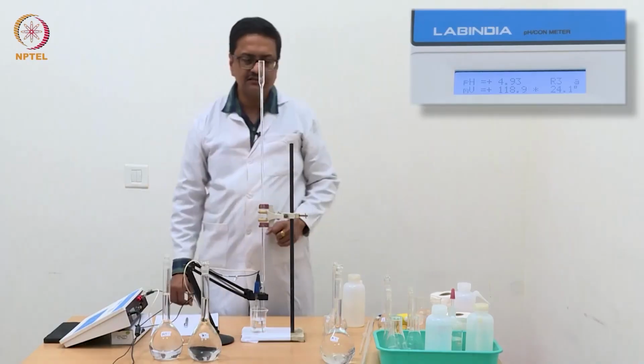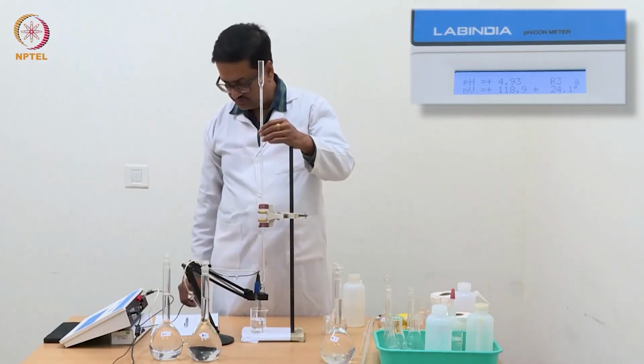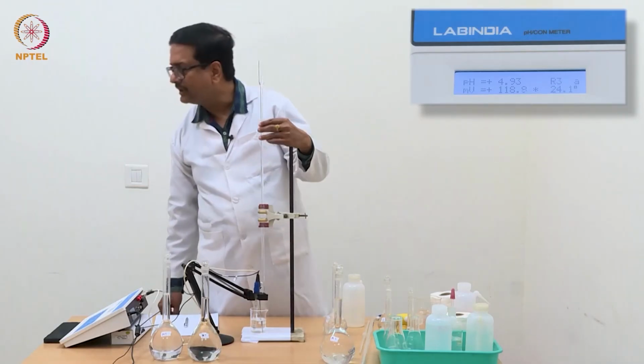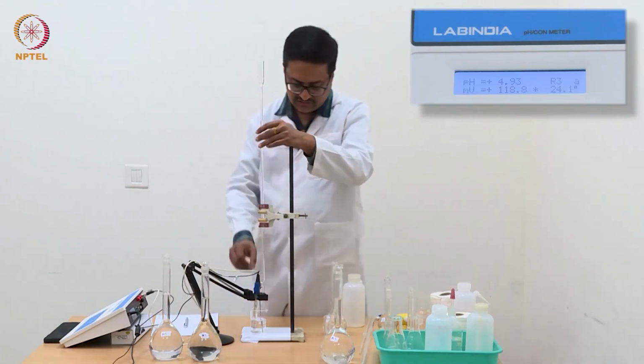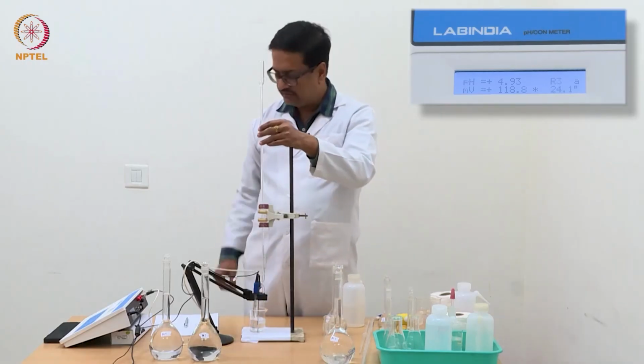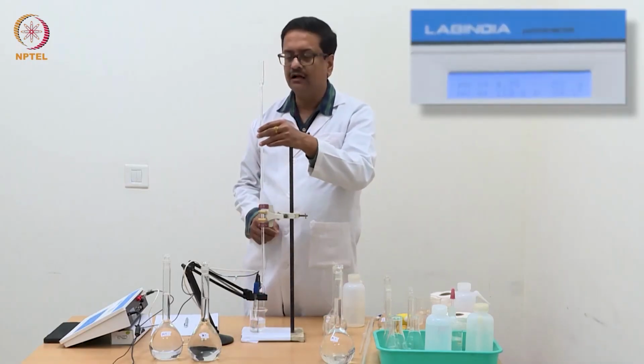So now I have reached a reading of 0.8 and the pH that we see here is 4.93. So it is still not close enough to 7 where we will see the jump.